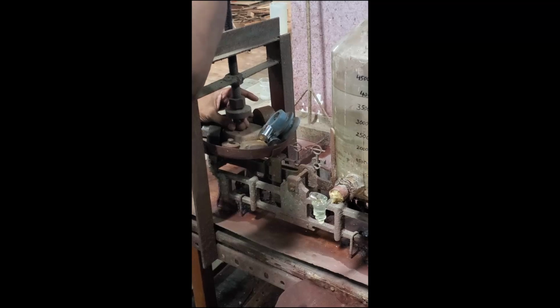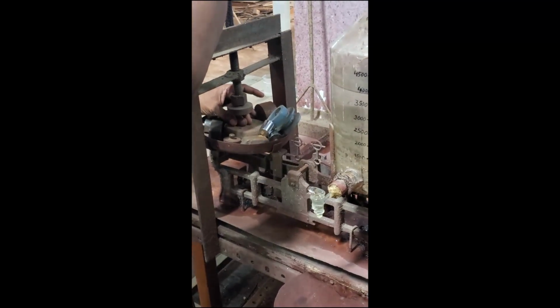We'll make it down in this one because we are checking the crushing strength. Just we have to touch the pellet.